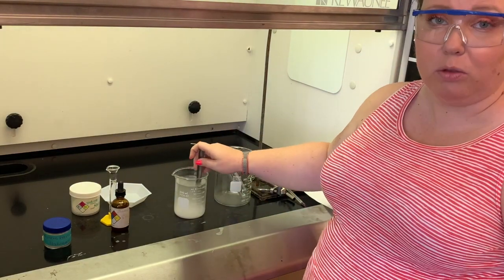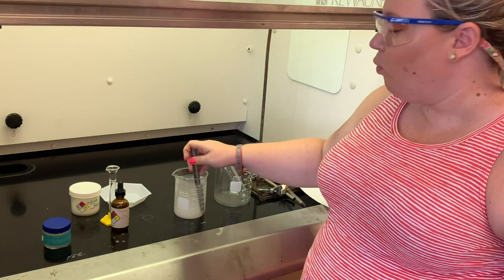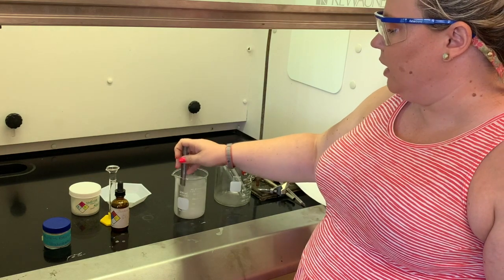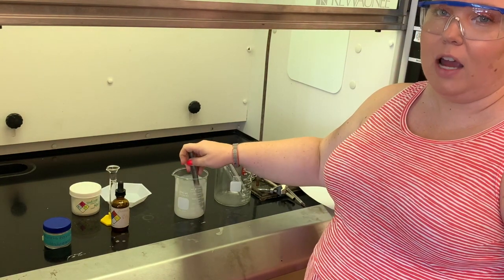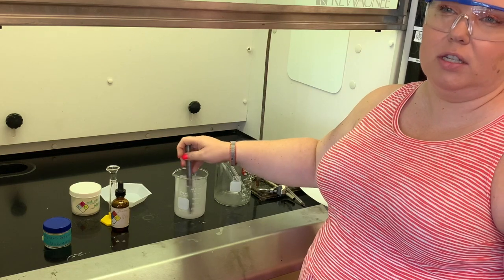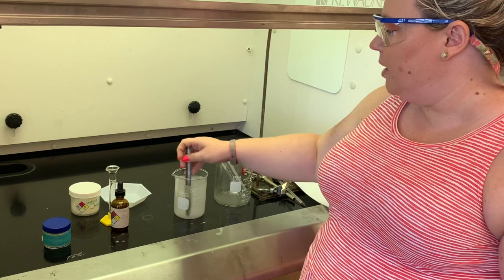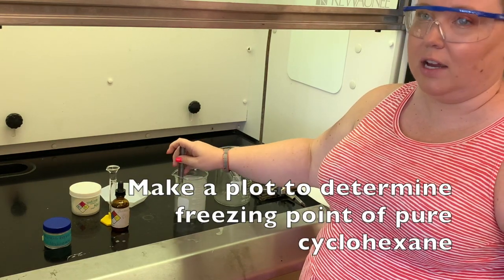We want to make this ice bath really cold so that we can freeze the cyclohexane. Once the cyclohexane is frozen, we're going to take it out of the ice bath and then monitor the temperature every 30 seconds until it reaches about 10 to 12 degrees. Then you're going to plot that data to find the freezing point of your cyclohexane.